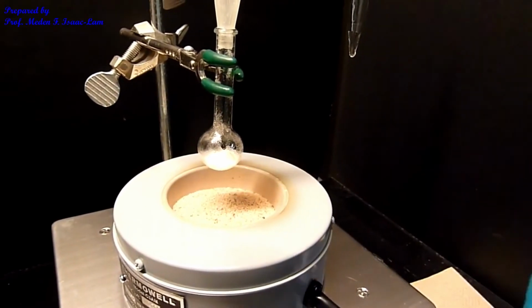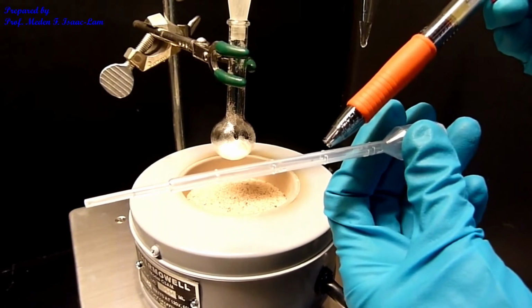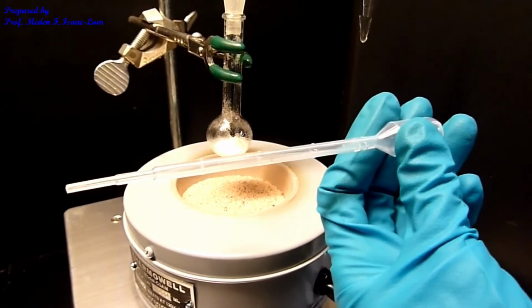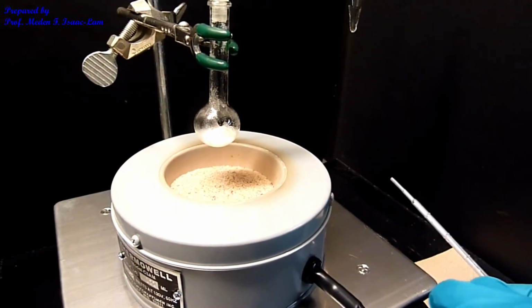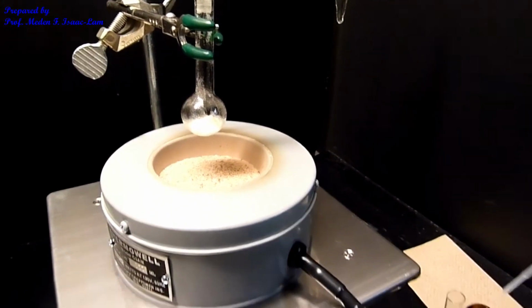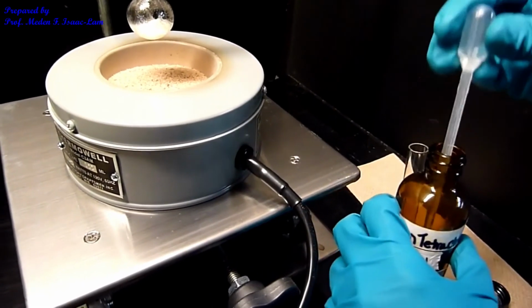So this is about 0.75 ml, so a little bit more. And the solvent, I can add a little bit more, so approximately 0.8.